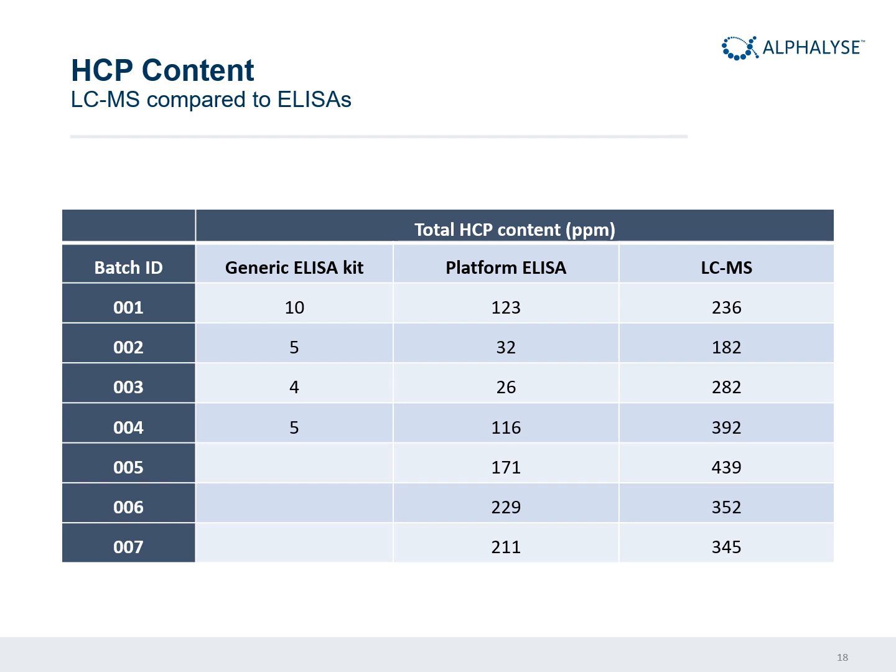I think this is something we see quite often, that ELISA is underestimating the amount of host cell proteins, especially in non-monoclonal antibodies. We typically have a higher level of host cell proteins than what you find from ELISA assays. But we have also seen the opposite way around.